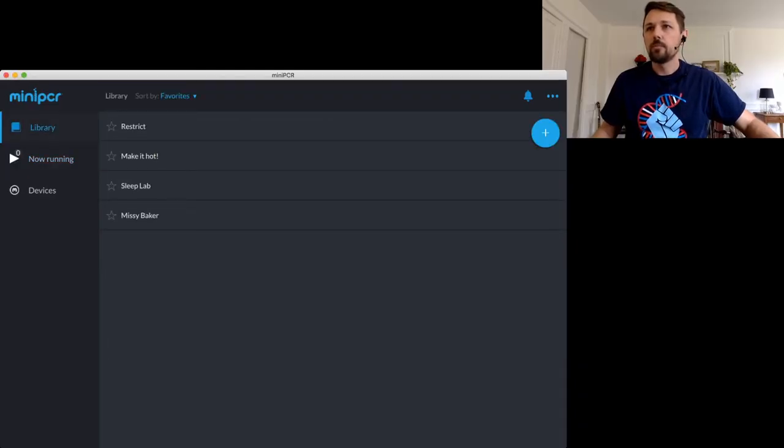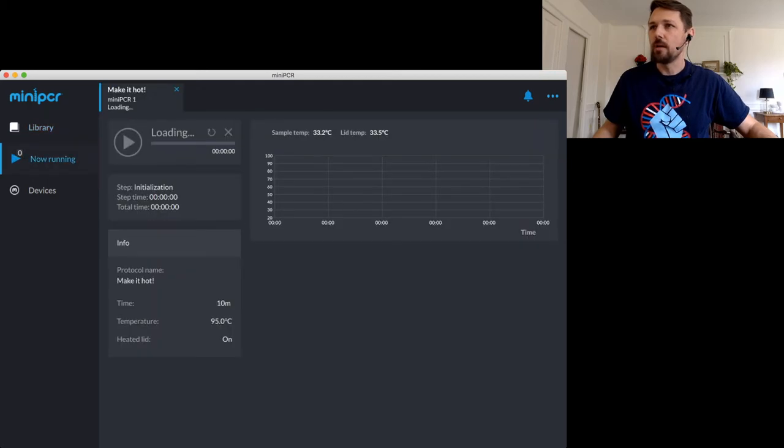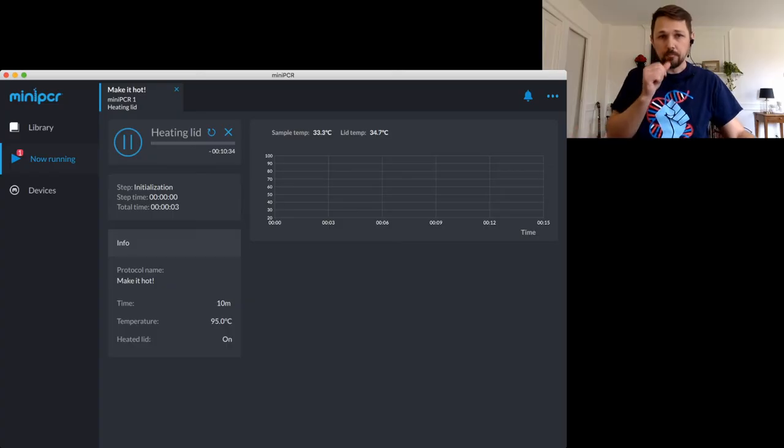So here we go. I have a program here called Make It Hot. That'll do 95 degrees for 10 minutes. And I'm going to do run. It's going to take about a minute to load, and then I'll show the temperatures there.